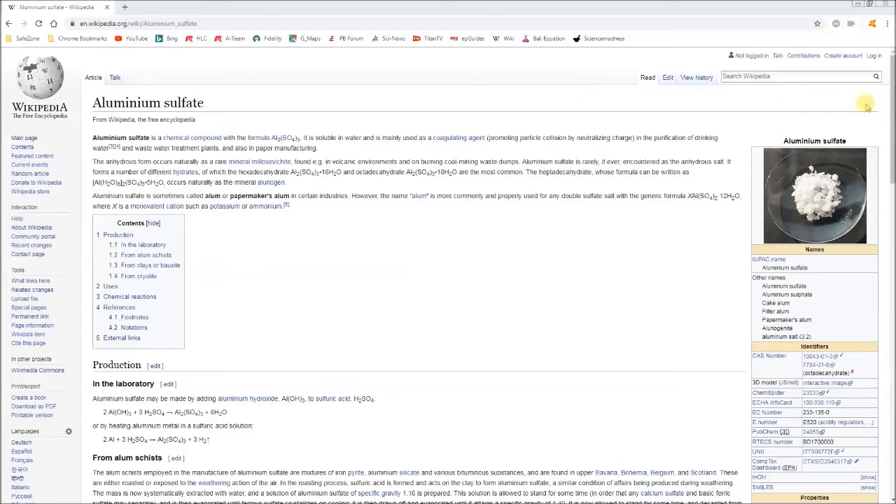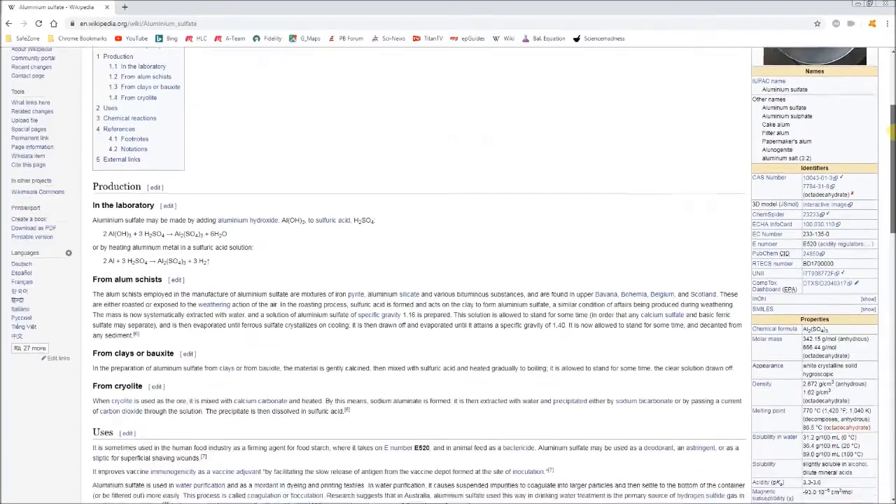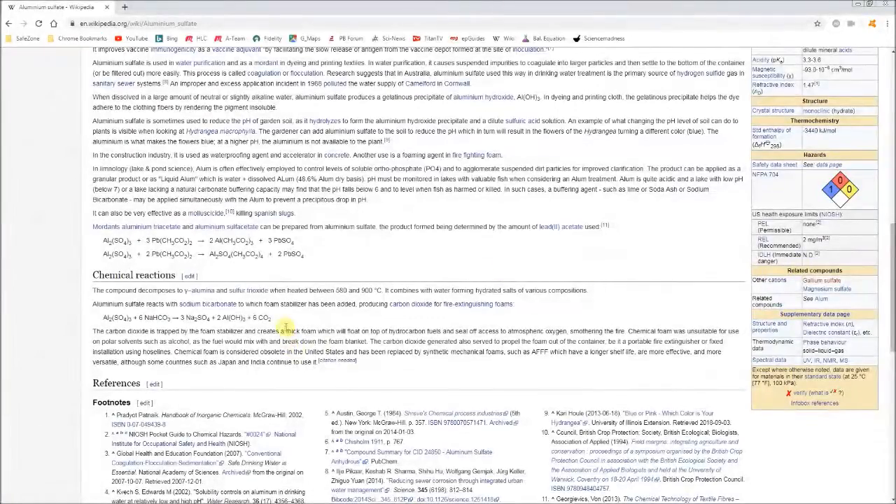This experiment was inspired by something I saw on the Wikipedia entry under aluminum sulfate. If you scroll down to chemical reactions, you will see a formula that shows a reaction of aluminum sulfate with sodium bicarbonate. The products are shown to be sodium sulfate, aluminum hydroxide, and carbon dioxide.